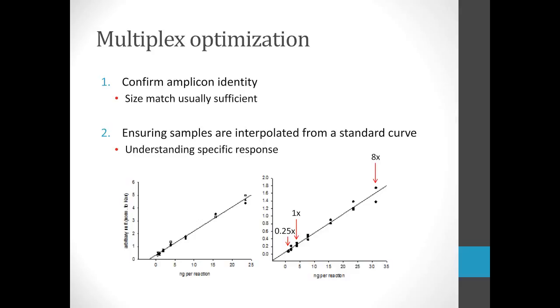Now, for my genes of interest, we stayed within the linear range of detection so that we could easily detect both increases and decreases in expression by interpolating data from a standard curve. This approach ensures the greatest accuracy and sensitivity for detecting changes in expression, since in physiology we rarely see increases that exceed tenfold.